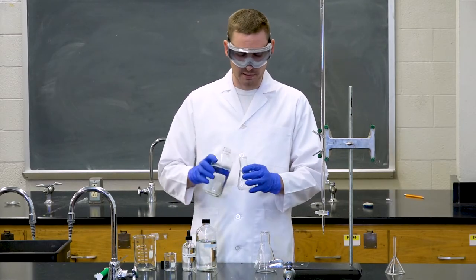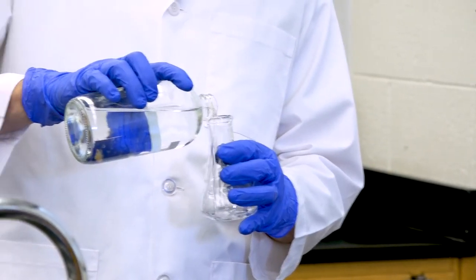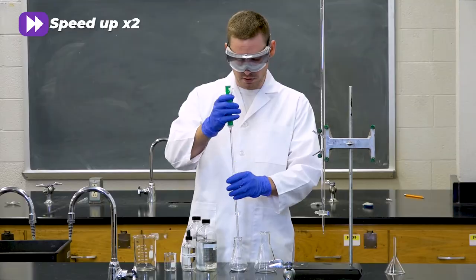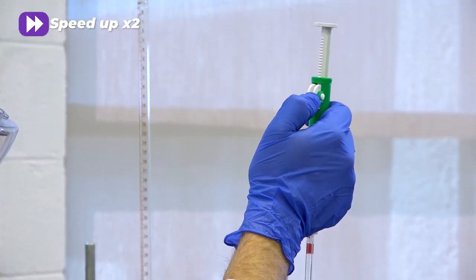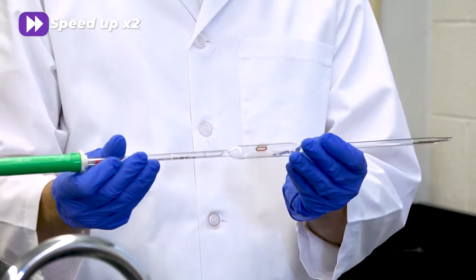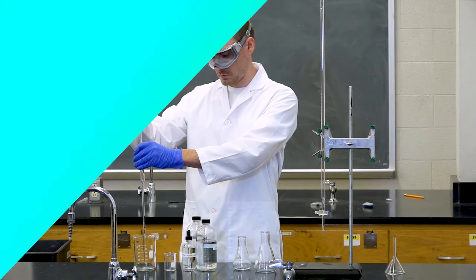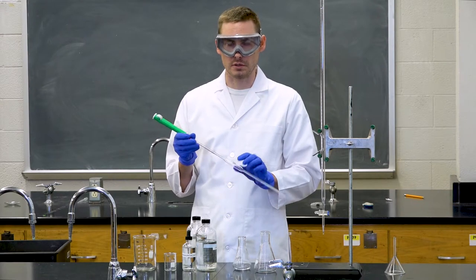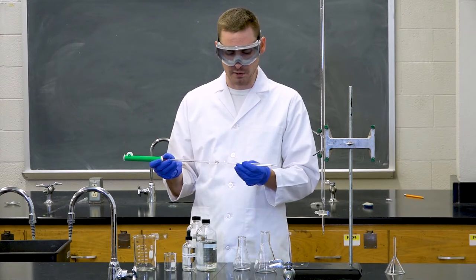So first we will add some of our solution to an Erlenmeyer flask, and then we will pull up some of the solution into our pipette. And then we can turn it on its side and just rinse the pipette with our solution. You need to do that 2 more times, for 3 times total, in order to rinse the pipette for our reaction.